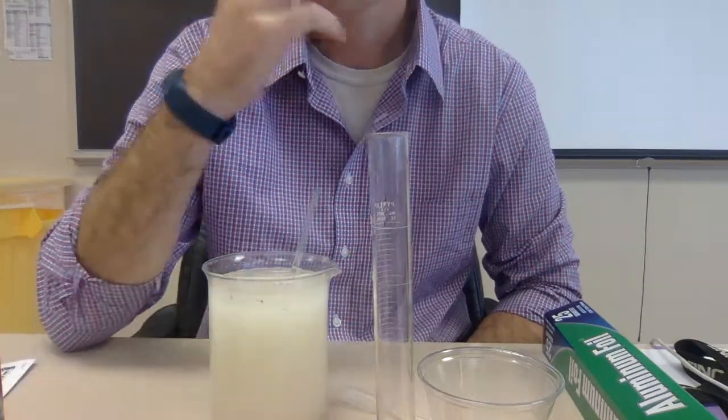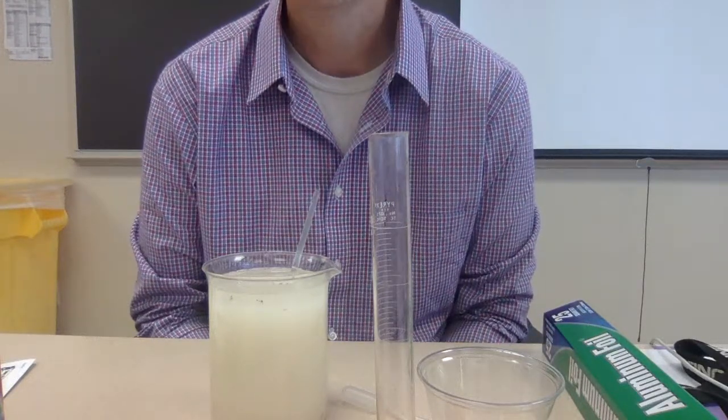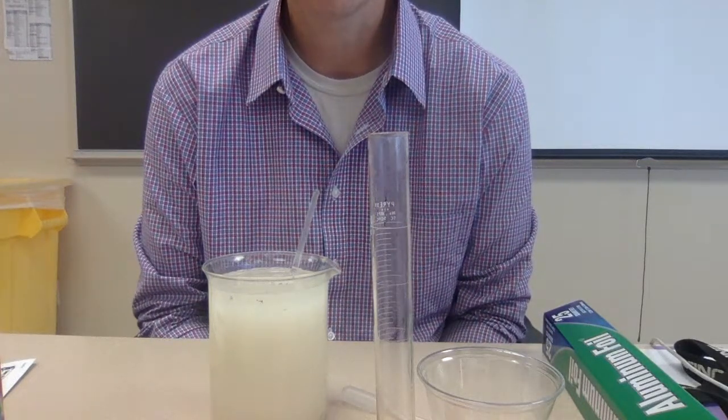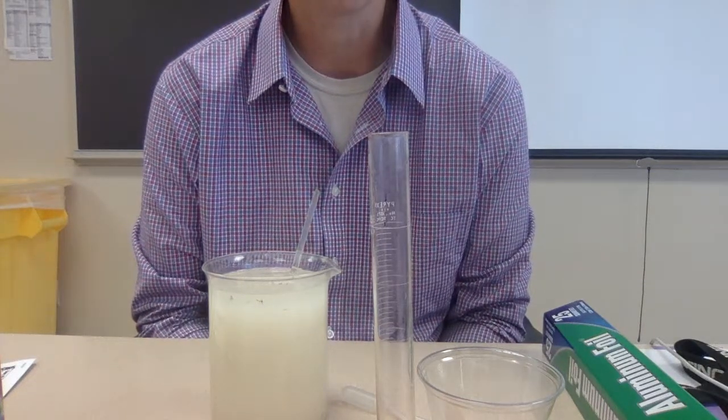So we're doing a yeast lab where we're going to be learning about populations and how they change over time. And so we're going to be looking at a population of yeast.